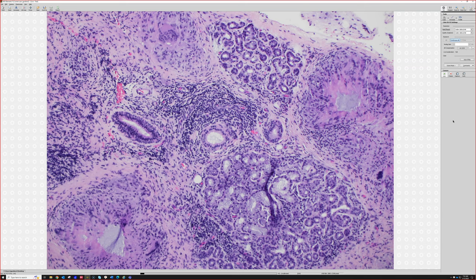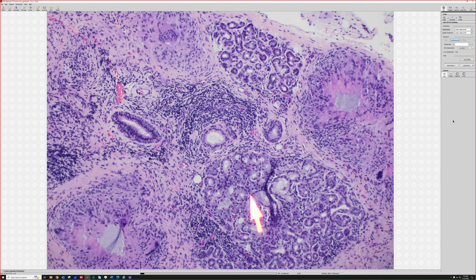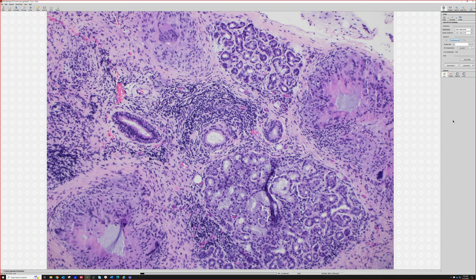That's what these guys are here. This is a mucin-filled. And then right here, we see salivary ducts, which are a double layer of columnar cells. And so it kind of is a little bit similar to sweat glands, right? Except that sweat glands don't have mucin-filled cells in them. And also the duct of a sweat gland is more like double cuboidal, not double columnar, but it depends on where you are in the salivary gland.